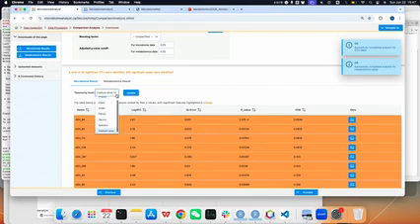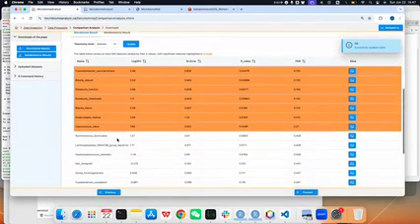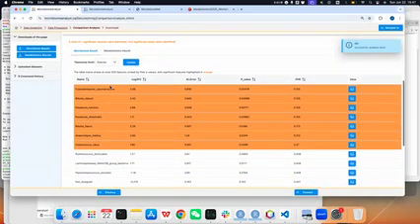And we can change the taxonomy level here. For example, we change to species, and the highlighted ones are those species with significant differences. Actually, these features are commonly seen in papers related to IBD studies.